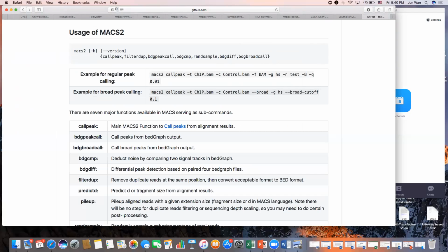You want actual discovery. And so when you run this, remember, I want you to do this two ways. I want you to run treatment and control together for narrow. And then I want you to run treatment by itself. And then I want you to run the broad version of it, same way, okay? Treatment and control, and then just treatment.